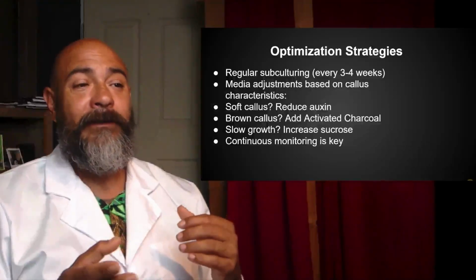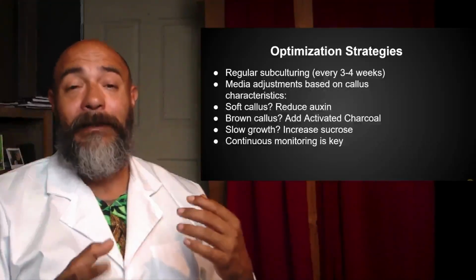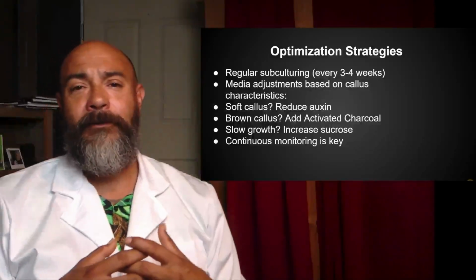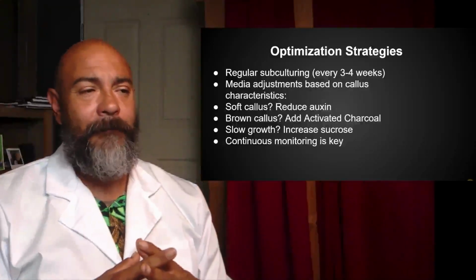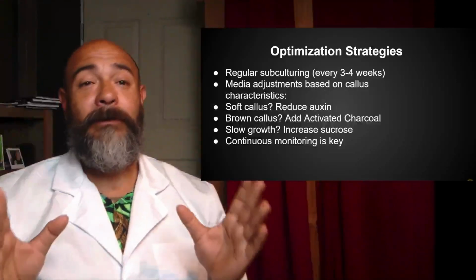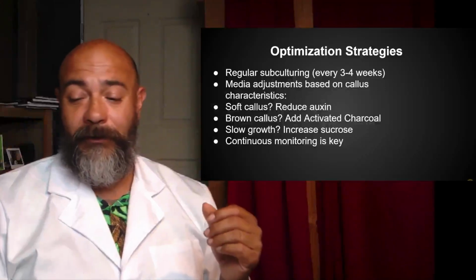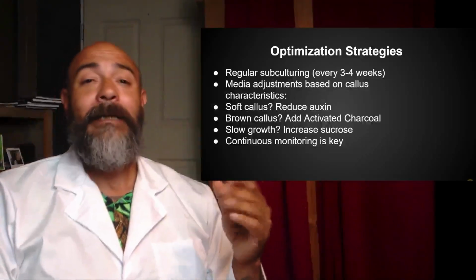If you would like to slow the growth down, or if you've got slow growth and you want to speed that up a little bit, you can increase the amount of sucrose or sugar that you add to your media. Remember, folks, continuous monitoring is key to good research. You want to be checking it regularly and taking notes.